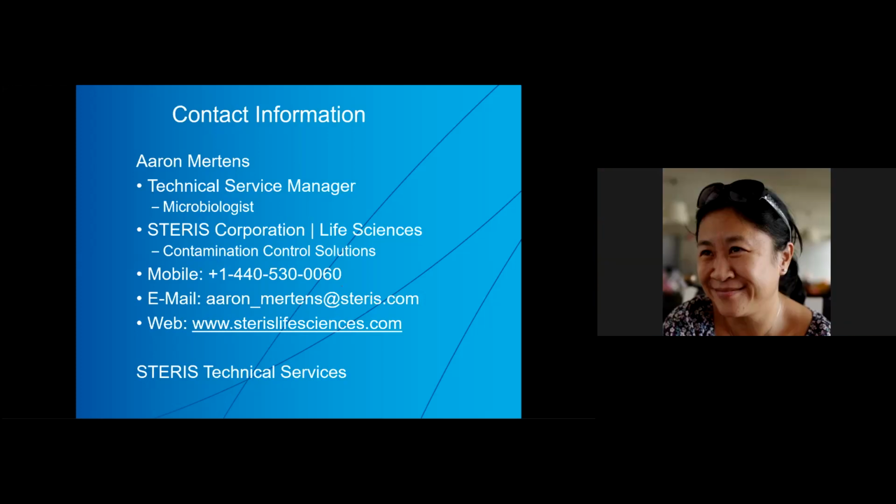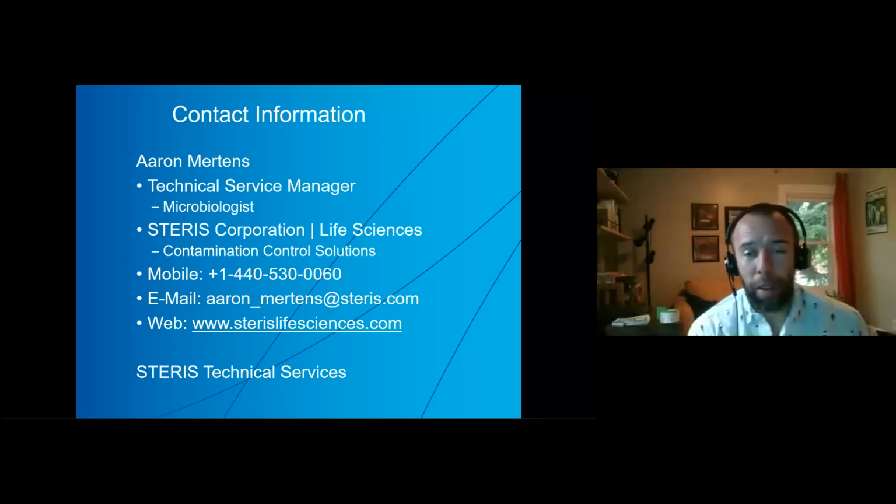Thank you. Is there any guide for determining the number of thermocouples for a given autoclave size? This is from Pitoyo. Yes, I would say that there's not very good guidance in the regulations, but my benchmarking experience is that you definitely want to use a minimum of 12 thermocouples and 12 biological indicators in each cycle, in each chamber run.